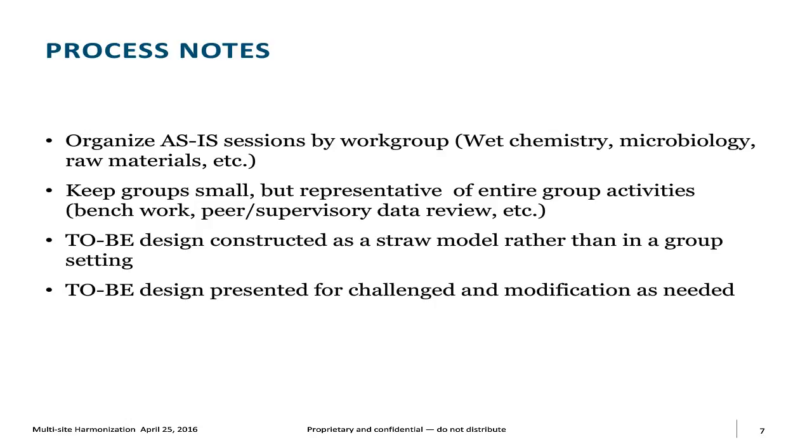You want to keep the groups small because too big of a group is intimidating and only a few people will be doing 95% of the contributions. We like to say 4 to 6 people is usually a good number, but they have to represent the wide context of the operations in the lab, meaning they have to have people that actually do the bench level work, but also do the review work and, say, the release of documentation and so forth.